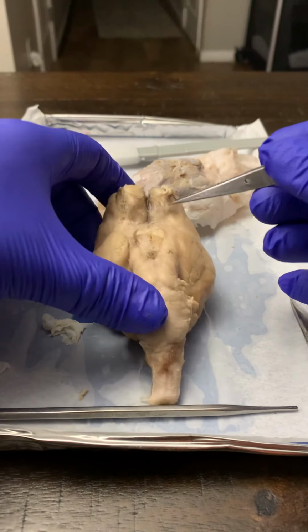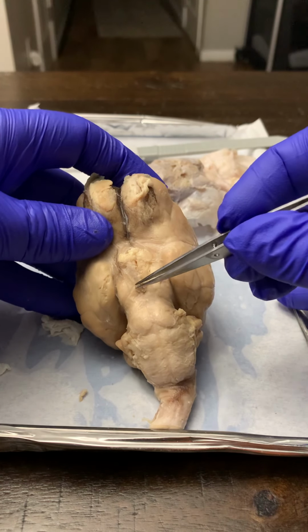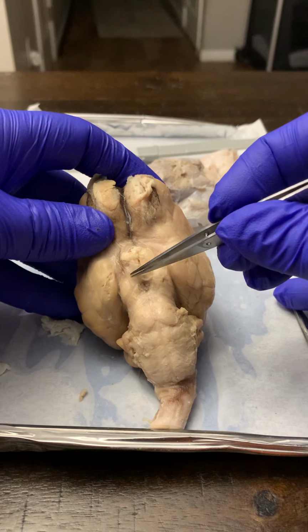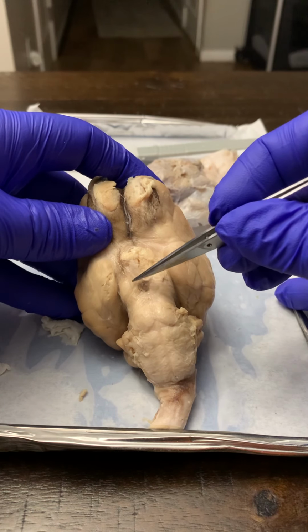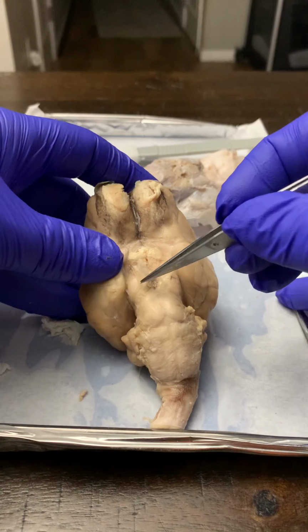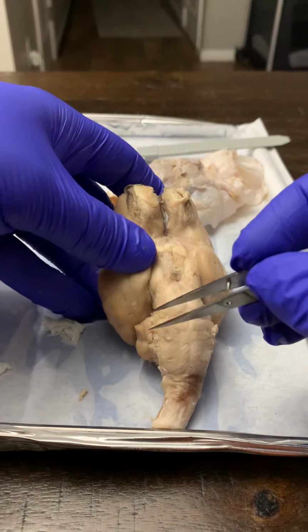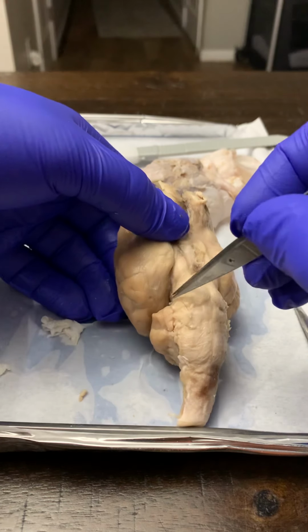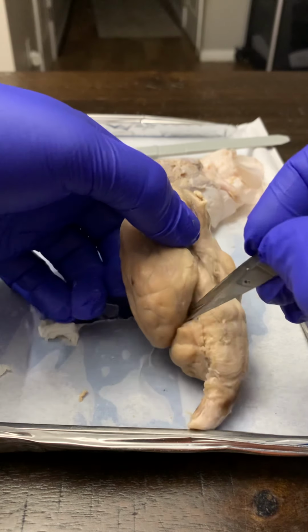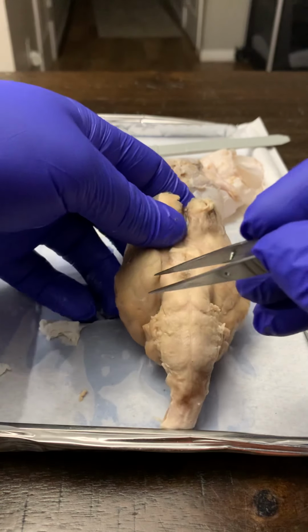For ocular motor, maybe when I cut this I can see a little better, but the ocular motor, cranial nerve 3, is going to be roughly in this area. I can't really see it very well, but maybe when I cut it open I can see better. Cranial nerve number 4, trochlear, is going to be this little guy right here. That little guy shooting out.